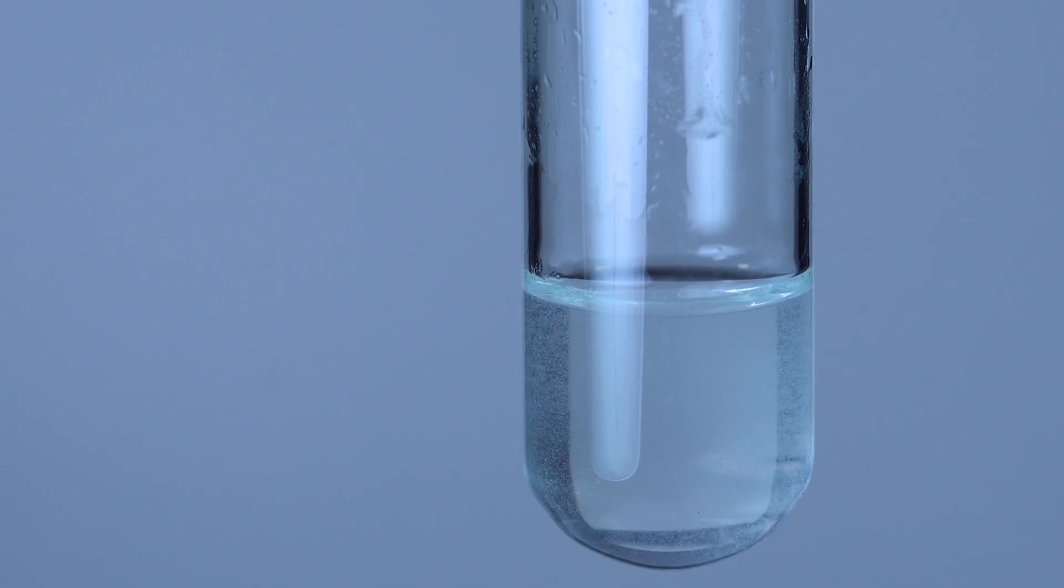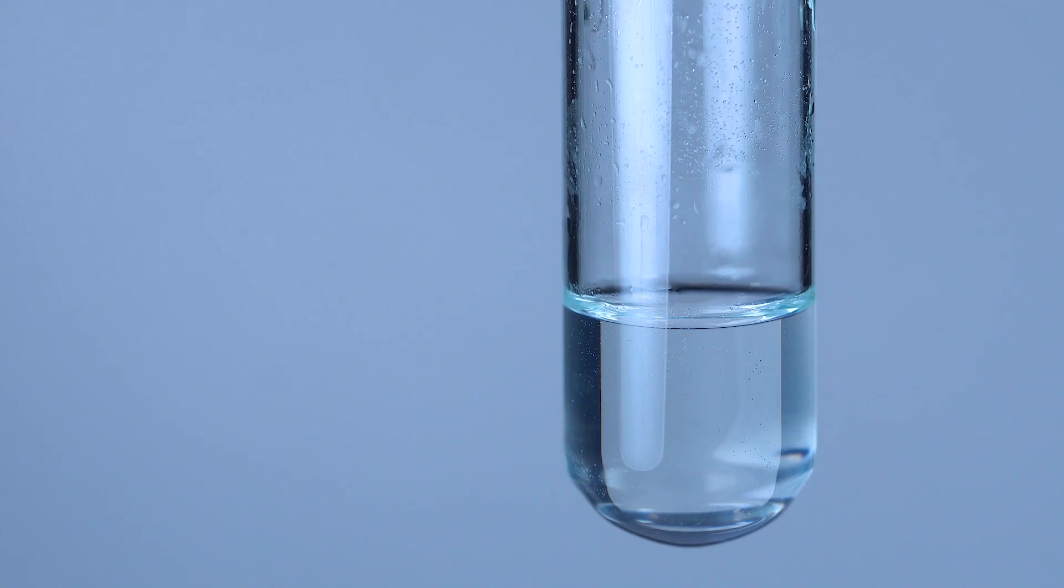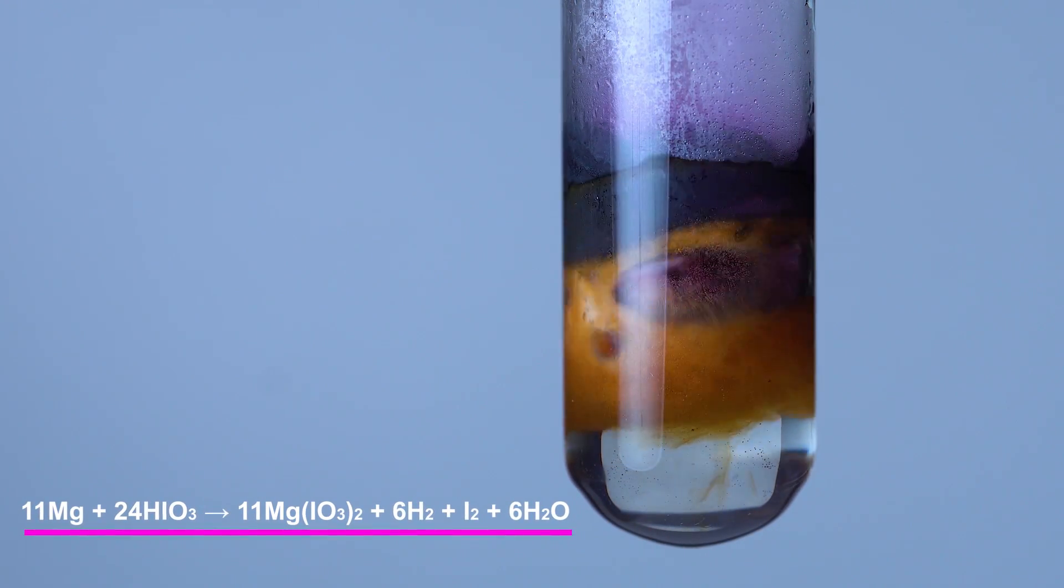Iodic acid is a strong oxidizer and, like nitric acid, gives different reduction products depending on its concentration. In this case, you may see the formation of elemental iodine.